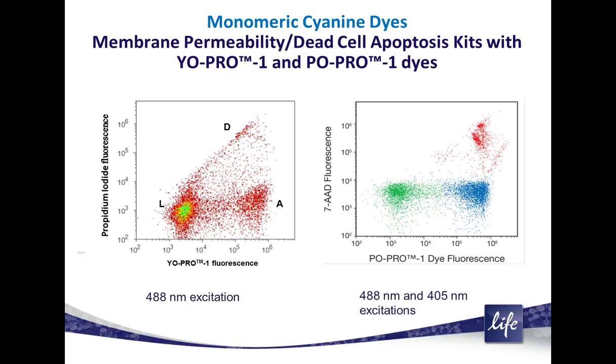There are some situations where staining with annexin is not the optimal method for detecting apoptosis. This would include assays where cells are sensitive to the high calcium concentrations required for annexin V, or assays where detection on adherent cells is adversely affected by trypsinization, or where washing of cells is prohibitive.